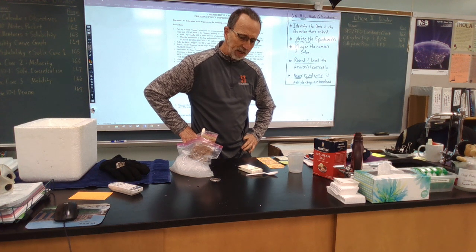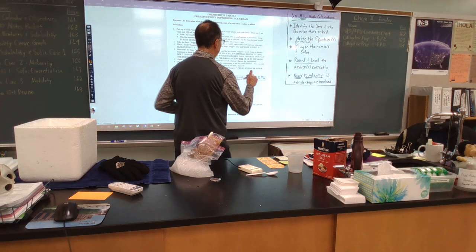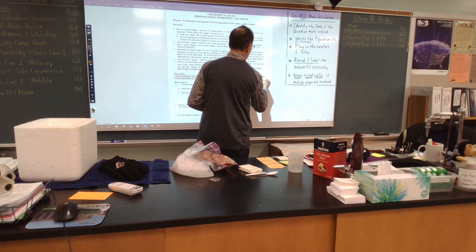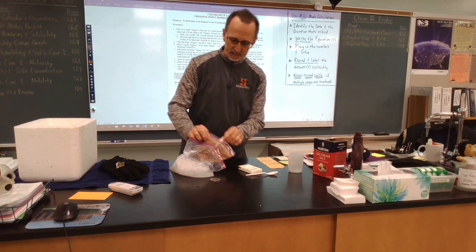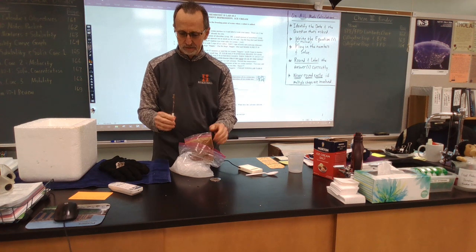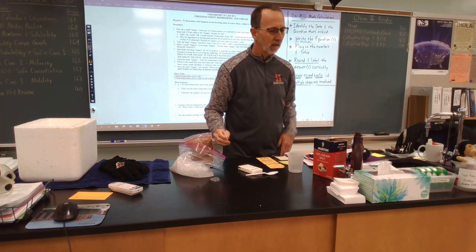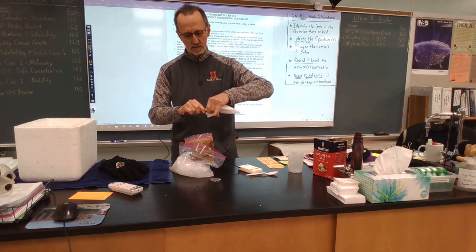It's actually about -3.0 degrees. Now, let's check the temperature. That looks pretty good. I would love to lick that off, but probably shouldn't.